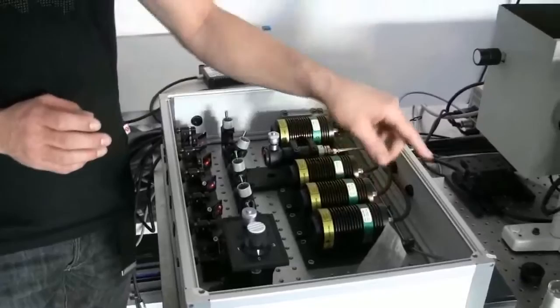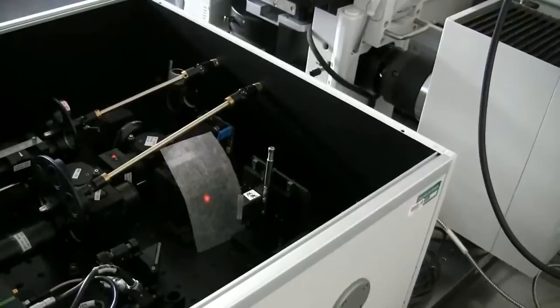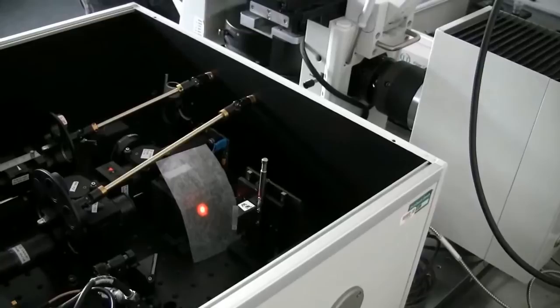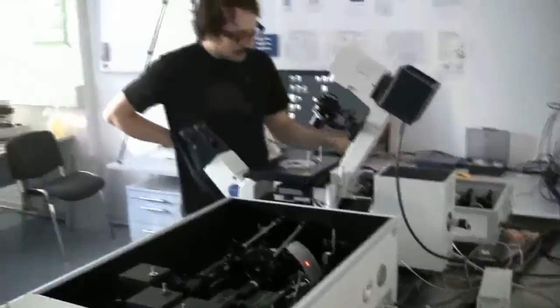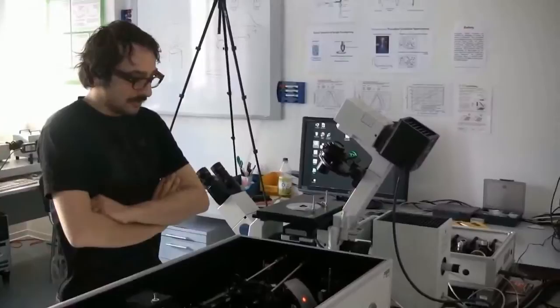By feeding these laser beams into a single mode polarization maintaining fiber, on the other side of the microscope you can see the beam coming out and the beam shape is nothing compared to the beam shape after the laser diode. You have a nice Gaussian beam profile, and even if I cut away portions of the beam you will see that the beam shape is not moving, it is not changing — only the intensity is reduced. So this box allows me to have a constant and nice beam profile so the image quality will not be deteriorated if this box for some reason might be misaligned. Also, all the lasers fed into the fiber will come out at the same position in the main optical unit, so all the lasers you are using will be overlaid in your image.